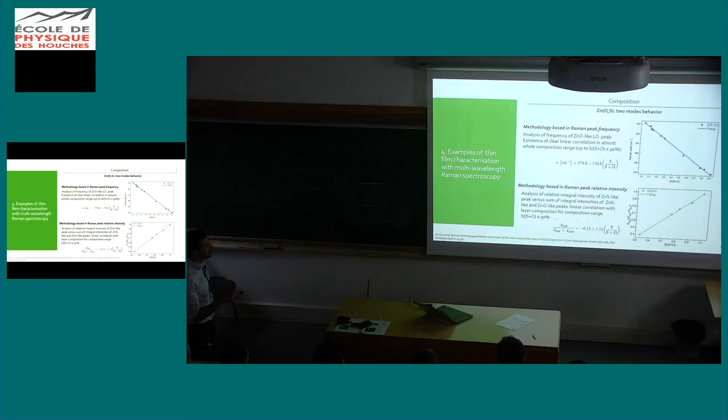Here you can see how just following the Raman shift of the zinc oxide mode, you can have access to the composition, and here following the ratio between the intensity of the different peaks corresponding to zinc sulfide and zinc oxide, you can also have similar information.